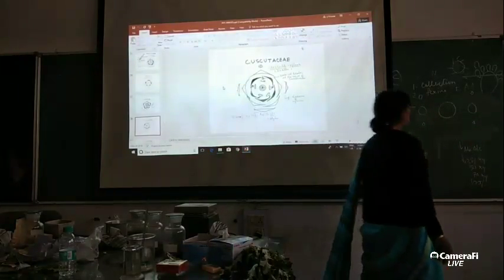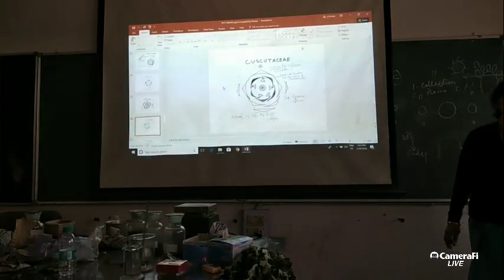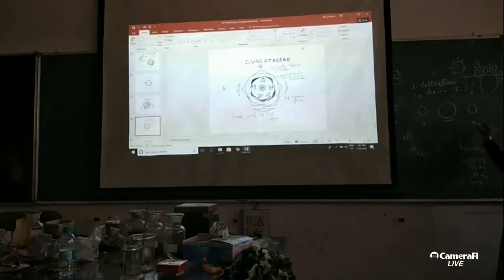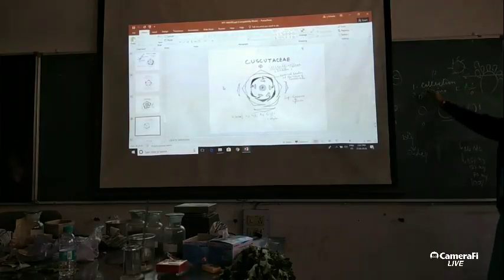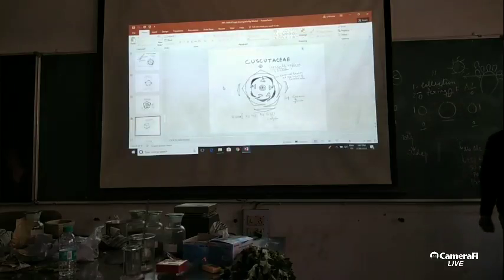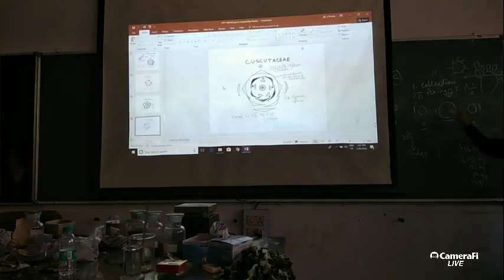Okay. Now, because it is Amaranthaceae, it will compulsorily have bracts and bracteoles. What do you find? You find a structure like this. This is the mother axis. होना कितना चाहिए? Each flower should have 1 bract and 2 bracteoles. Instead, when you count upon it, you are going to find only 7 such structures which are there.